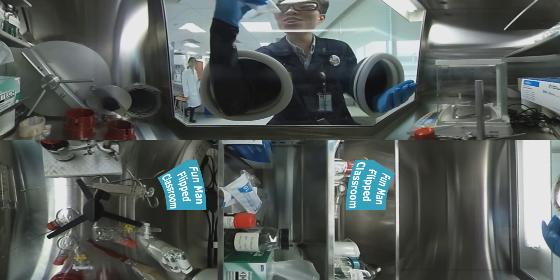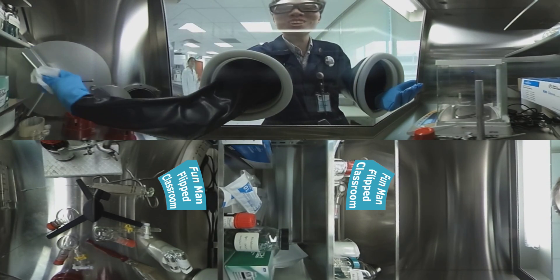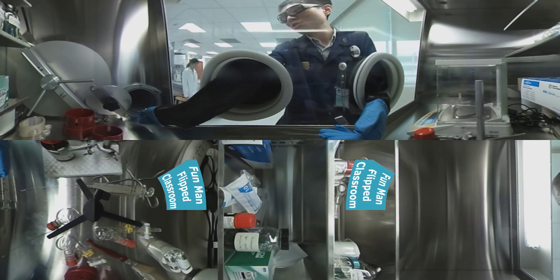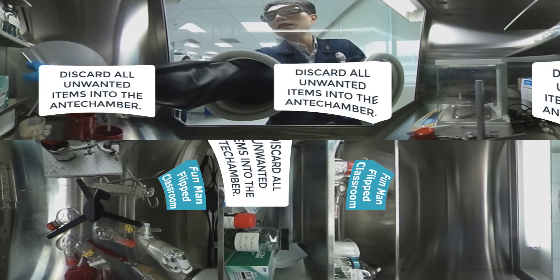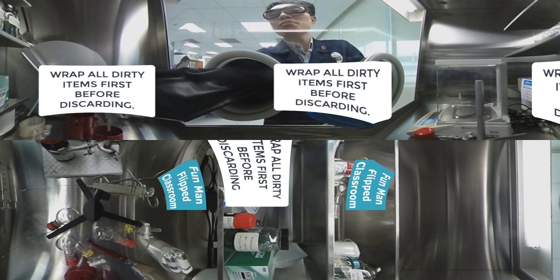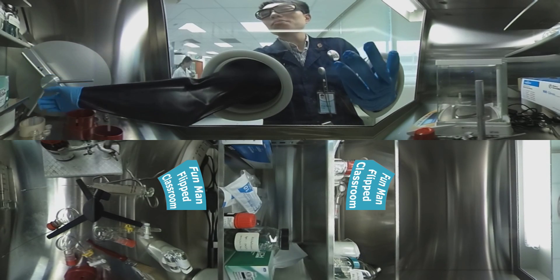Oops — I forgot I'm wearing gloves in a glove box! I can't touch my face. That kimwipe is wasted now, but my face is still itchy. Let's wrap things up here. Now we're going to discard the waste inside the anti-chamber. If the materials are dirty, wrap them up first.